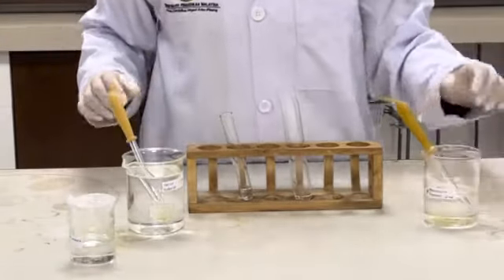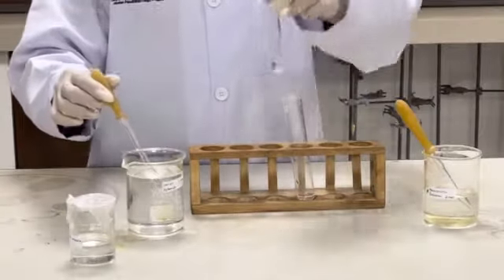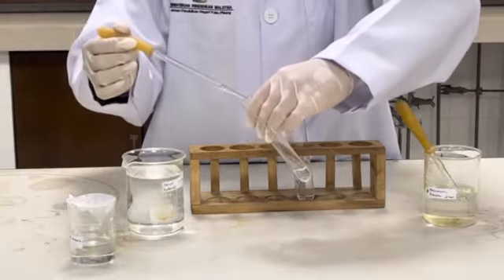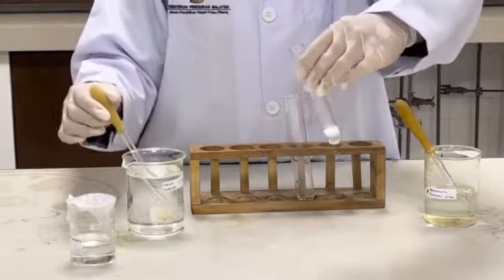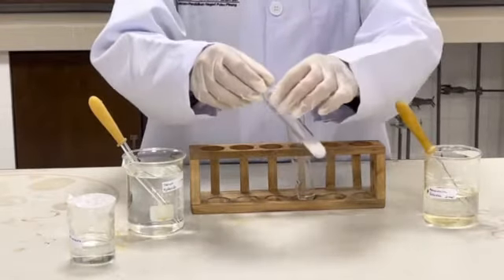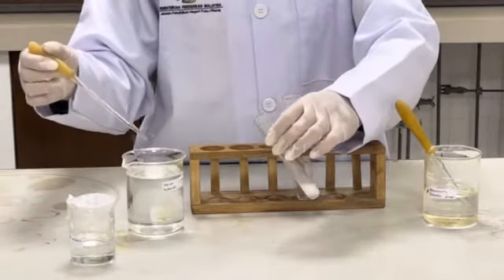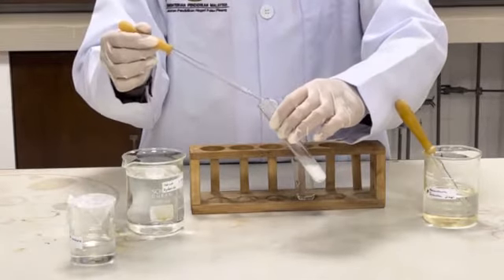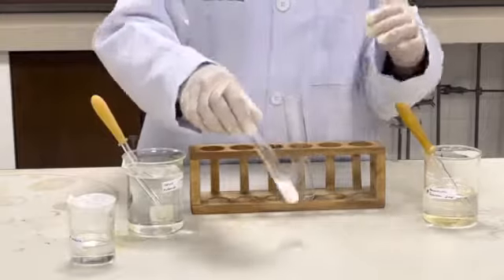First we add a few drops of sodium hydroxide solution and see what happens. With a few drops, you see a white precipitate. Then we add excess sodium hydroxide solution, and it still produces a white precipitate.